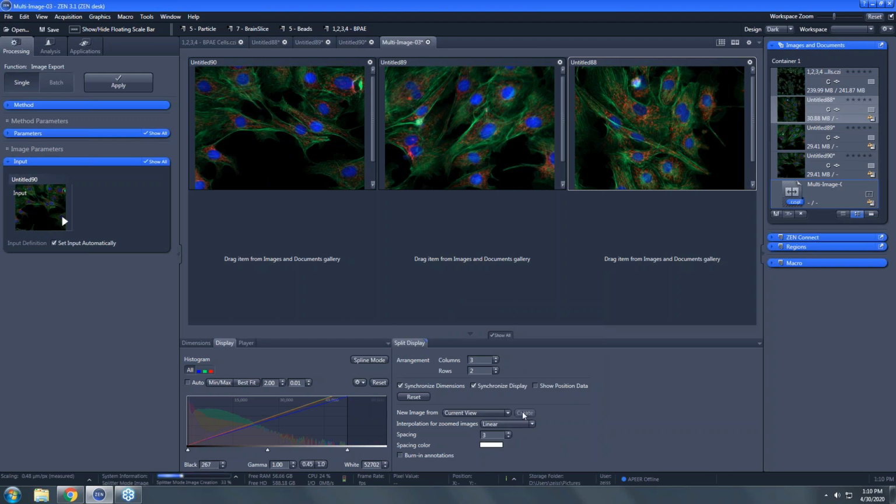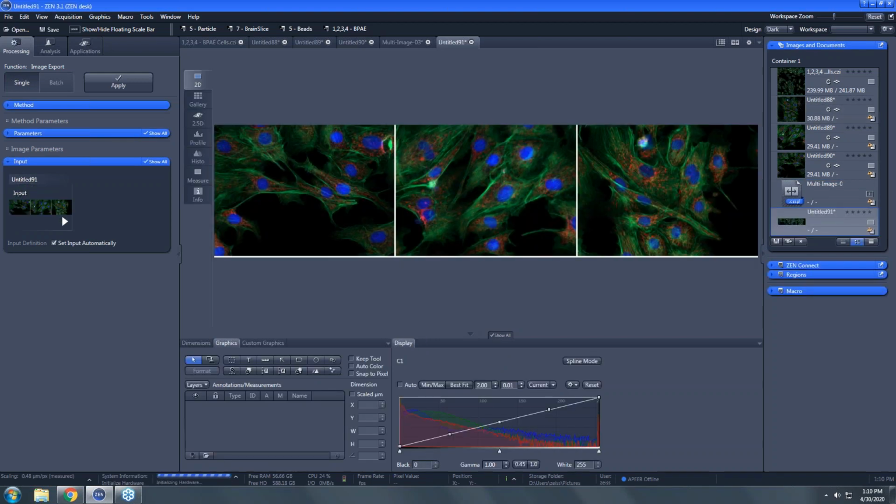And I don't know about any of the rest of the audience, but I have spent a remarkable amount of time in Photoshop and Illustrator cropping and positioning individual images in order to get them to look exactly like that. And it's time that I have not learned anything from or benefited me in any way other than to get the result. So I use this figure creator all the time when I'm providing people results from their demos, or if I'm doing a tutorial like this and I'm trying to compare A with B.